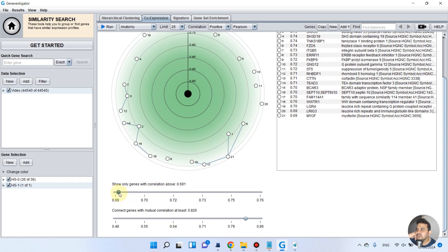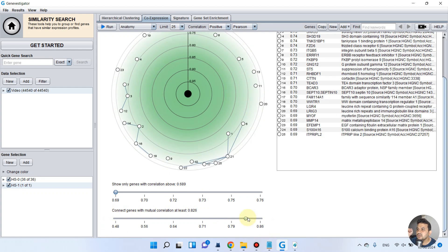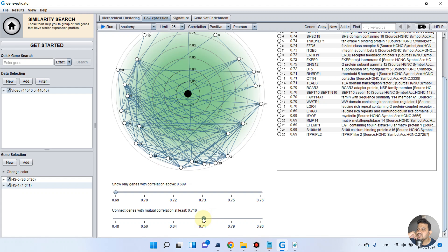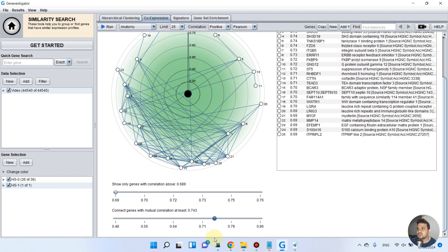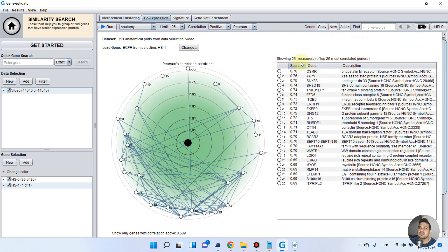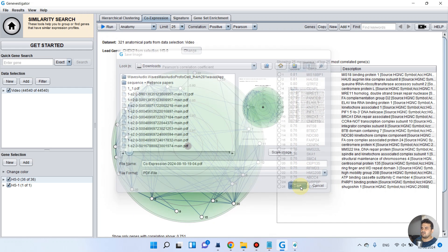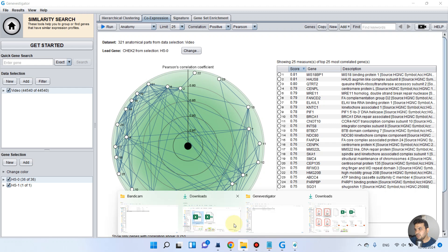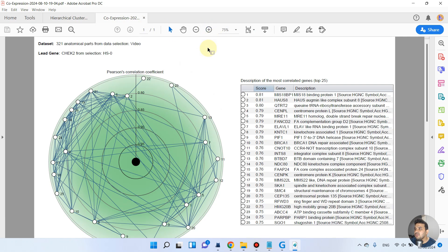The gene we selected is EGFR. As you can see, whenever we increase the correlation threshold it decreases the number of co-expressed genes in the network. Let's set it to 0.5. There are many genes which are difficult to interpret at that threshold, so you can decide your own threshold. We can set it to show at least 25 genes which are most correlated with the expression of EGFR. You can save this image as a PDF — here we have the co-expression network of that specific gene, showing a list of 25 genes from the database.